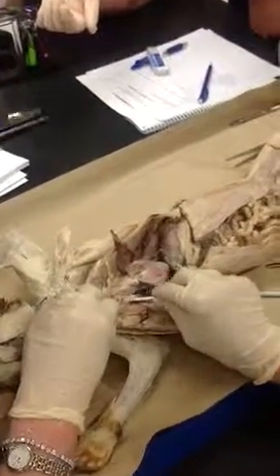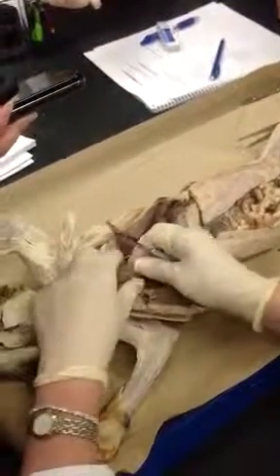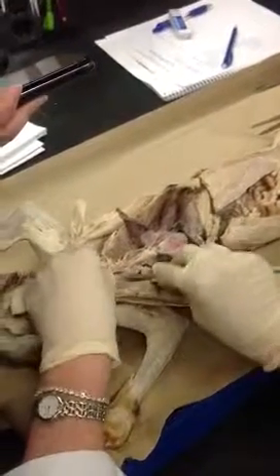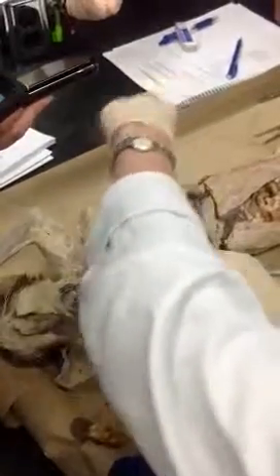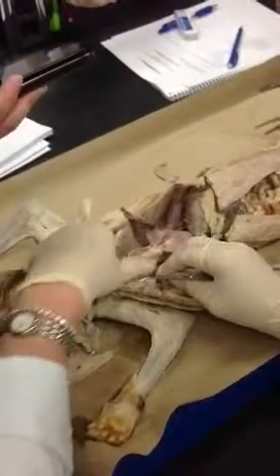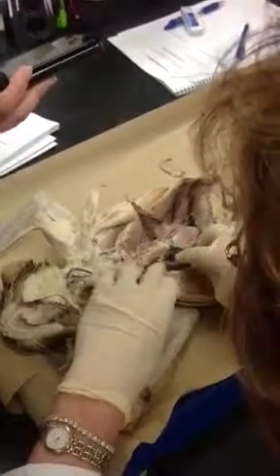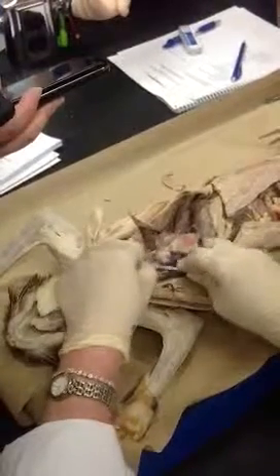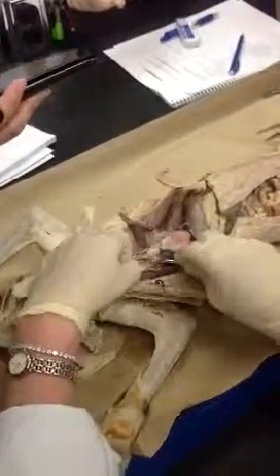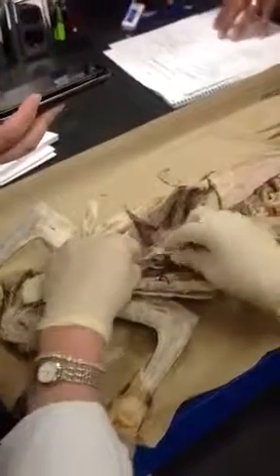All right, so we're going to follow this left branch. And you want to try to leave the big veins in place, because we'll come back to the veins here in just a minute. But all this kind of material you can pull out. So you're not going to need that anymore. One of the problems of this is that the superior vena cava sits right on top of that. So we're going to map so I can show you that.